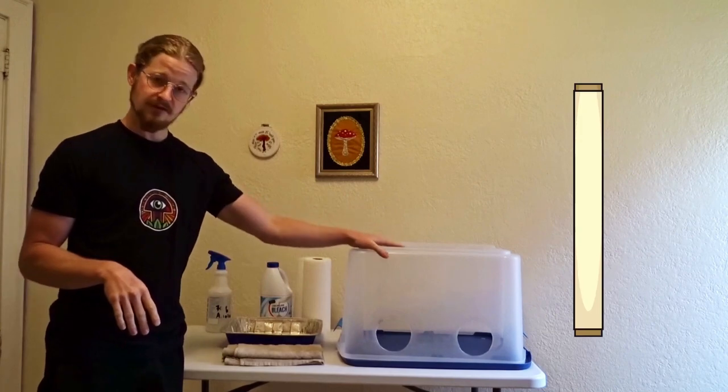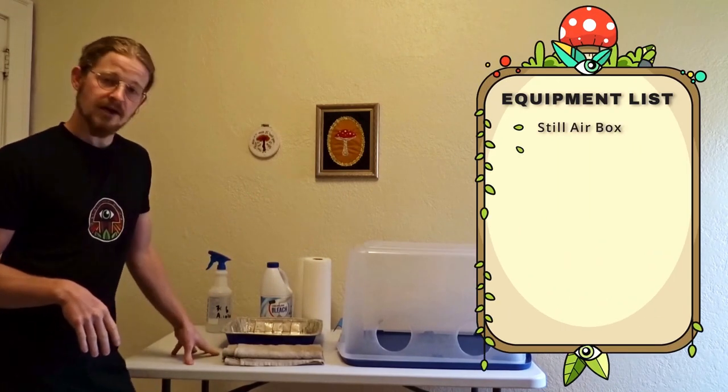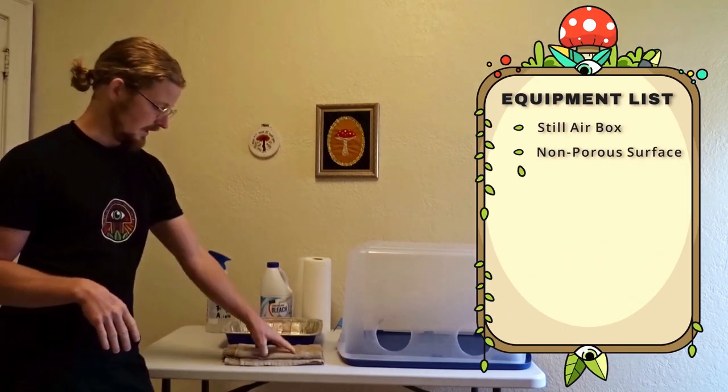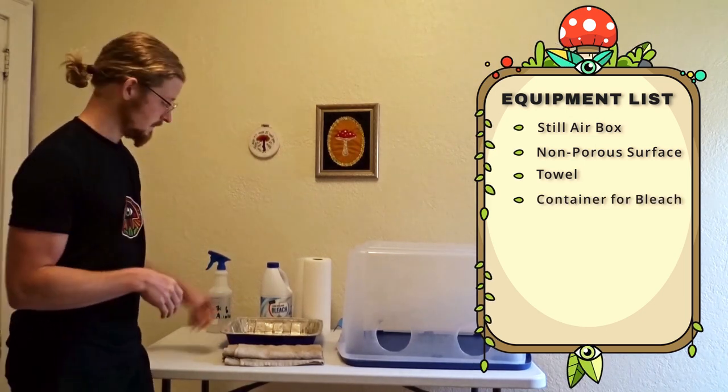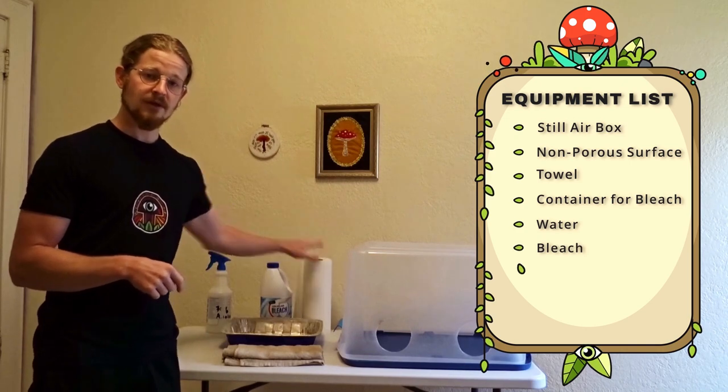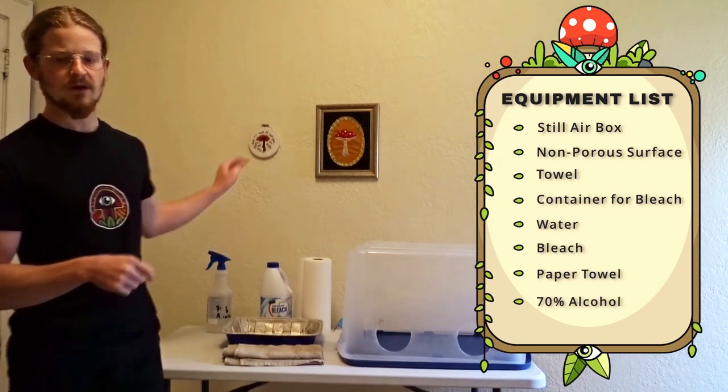What you're going to need is your Still Air Box, a hard non-porous surface, a towel, a container that you're comfortable putting bleach water into, water, bleach, paper towels, and 70% isopropyl alcohol.